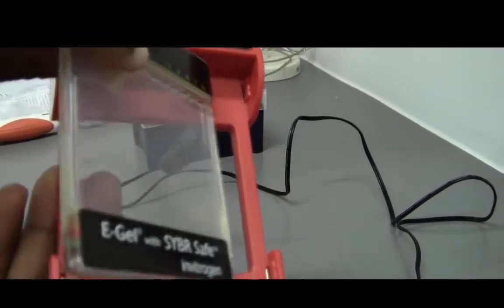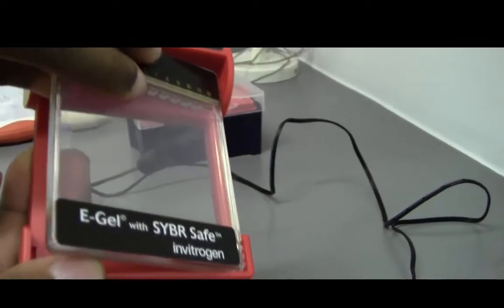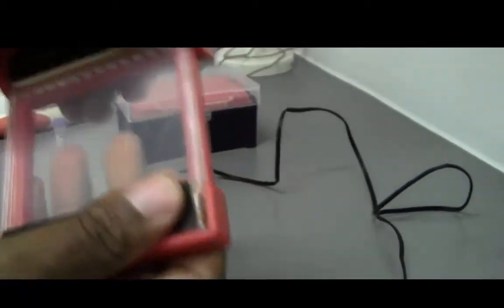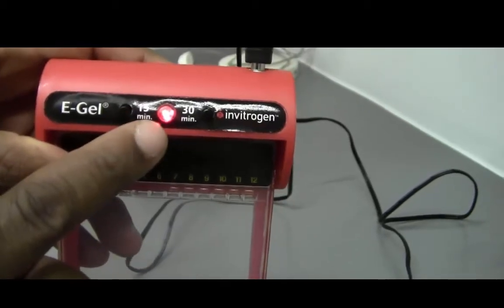So you put that side in first. Make sure it touches. It's in place and then you clip it down and if it's plugged in you'll see a red light.